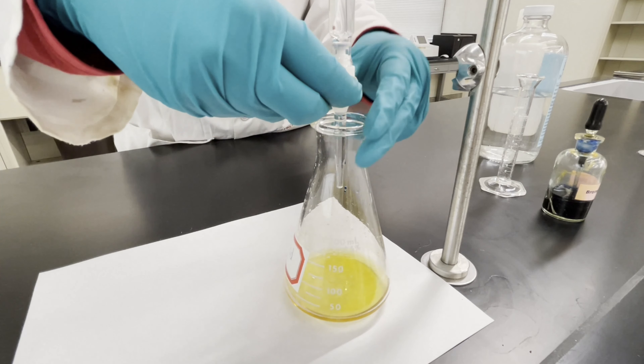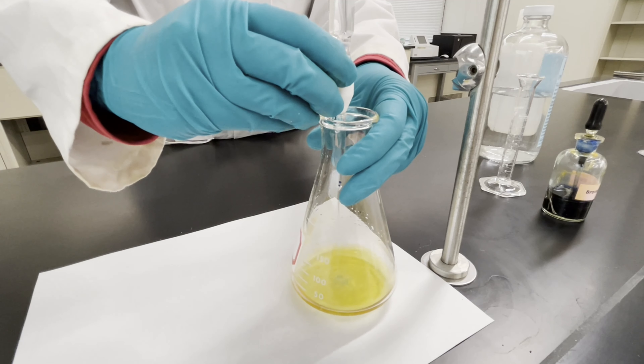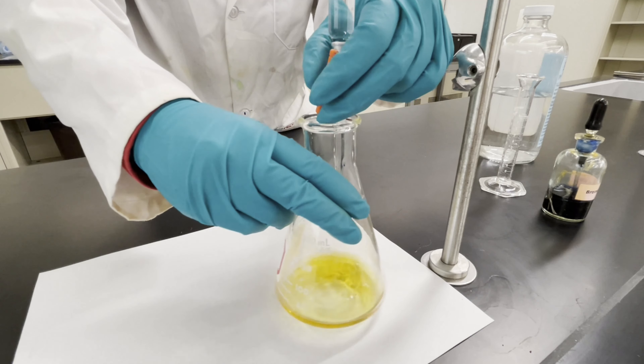Soon you'll start to see that flashes of color appear as you swirl the flask. As you can see, it's starting to turn green. It's important to keep swirling your flask at this time.